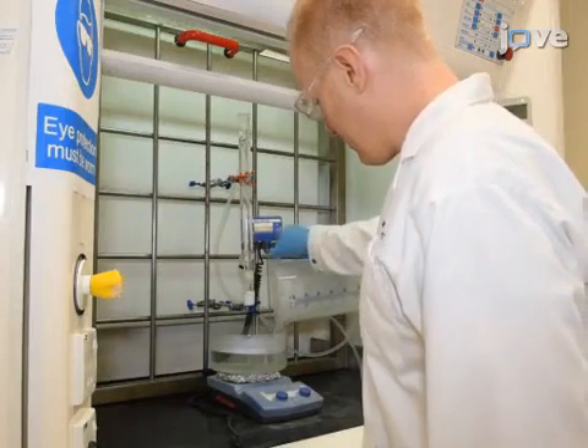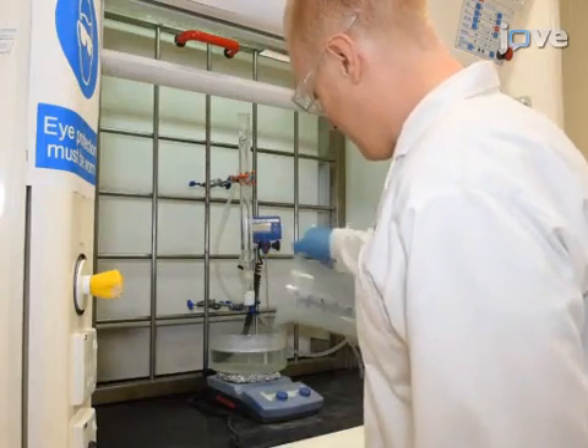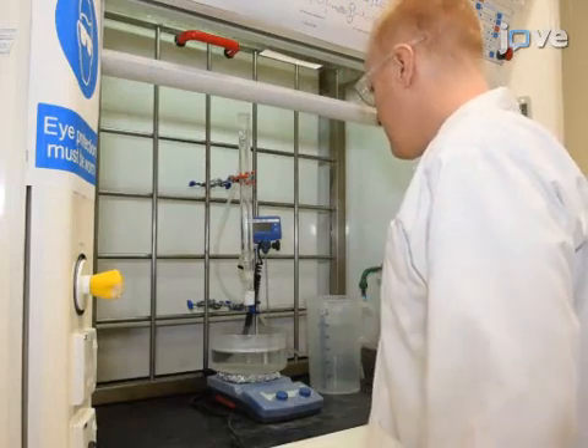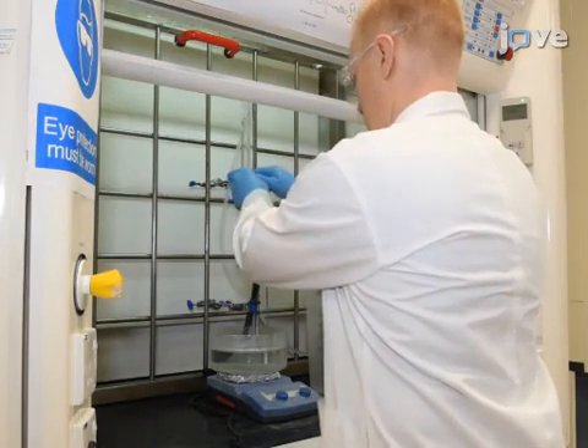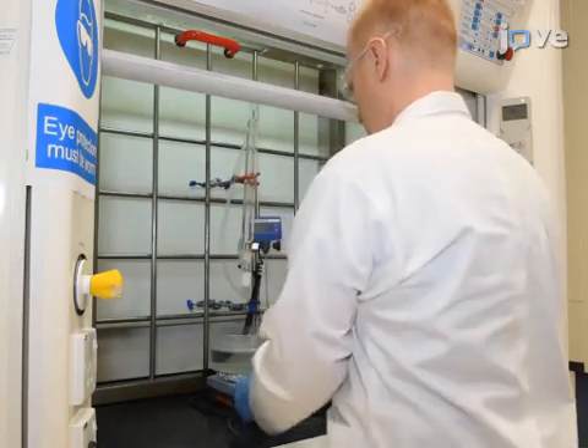To begin this procedure, prepare a reflux setup in a fume hood with a glass condenser, a water circulation system, and a water bath. Since the SEC extraction process involves use of highly corrosive hot acids and organic solvents, the process should be performed with proper personal protective equipment.